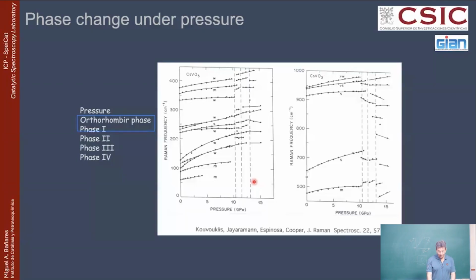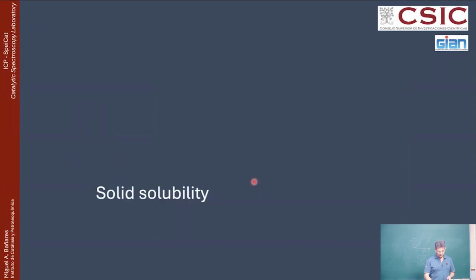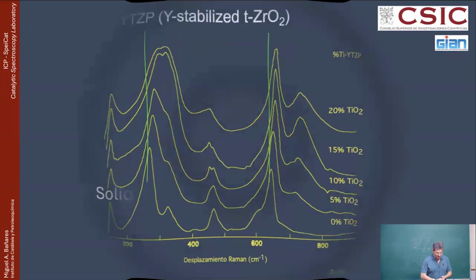So this is what we can see with Raman spectrometry. Again, the great advantage is that you don't need a synchrotron, you don't even need an X-ray system, you can use it in your lab very conveniently. Organic chemistry is probably one of the disciplines that really enjoys Raman spectroscopy, and that's good, because organic chemistry is basically what is used to make most of the catalytic materials.